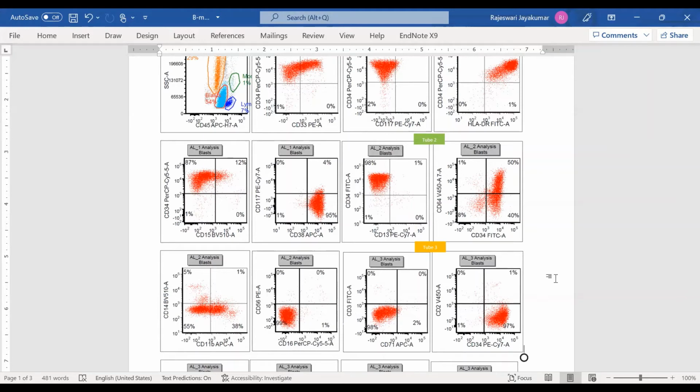When the myeloid blasts are monocytic, then it gets a little tricky, because the monocytic markers CD64, CD14, CD11C are considered more specific. CD64 can be seen in myeloid blast also, but you don't see that in B lymphoblast. CD64, CD11B, CD11C, CD14, lysozyme, non-specific esterase if it is a tissue specimen or cytochemistry specimen. Those are considered specific markers for monocytic lineage, and you need at least 2 of them to be positive. And very bright CD13 and very bright CD33 are also considered more of a myeloid lineage marker. CD117, CD13, and CD33 also help in distinguishing myeloid from lymphoid blast.